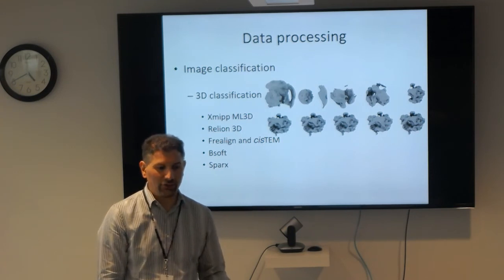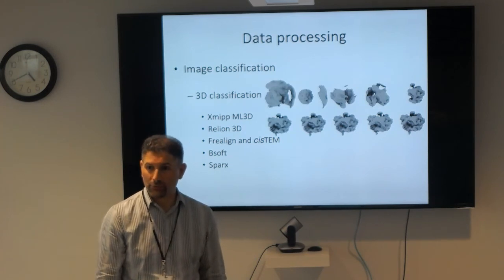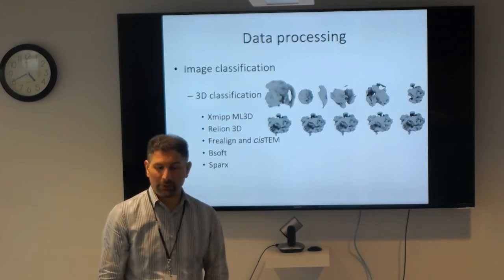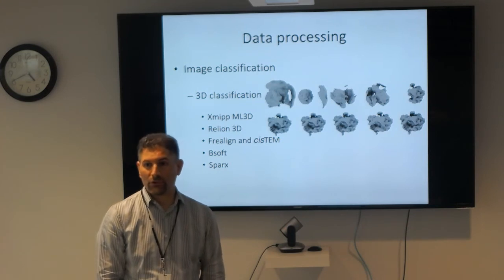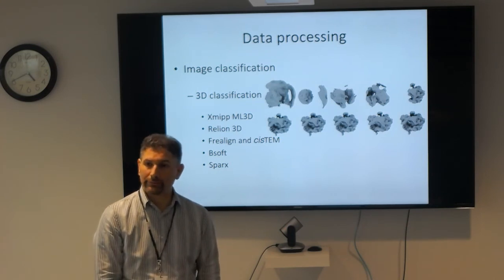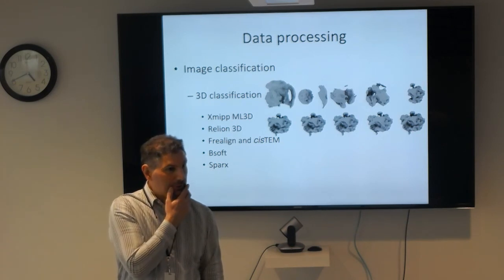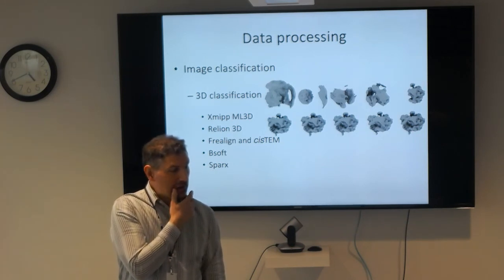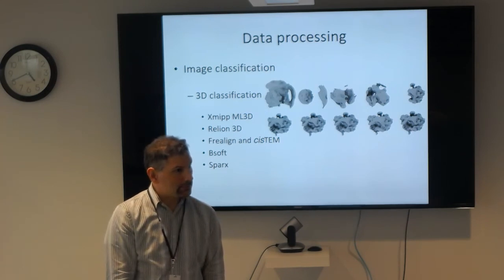The best strategy, obviously, is to go back and collect more data, right? But if you don't have time on a scope, all you can do is play with the data and take that strategy. That's worked for us to a certain extent, but we had to go back and collect more data. So sometimes things will go only so far. Okay?